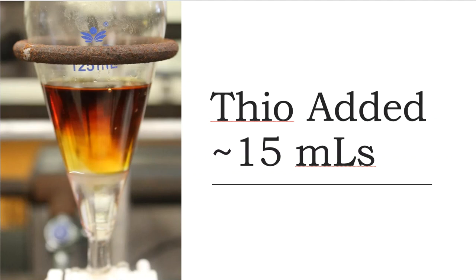You can actually see it here at the bottom. Thiosulfate's made with water, so the density is going to be close, maybe a little bit over 1, and that's okay. It's an aqueous solution. That's why we see 2 different layers that are formed.